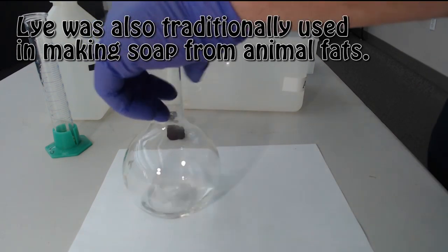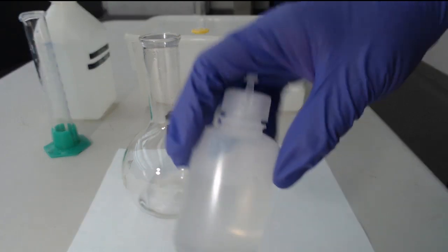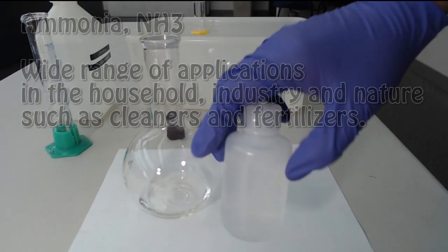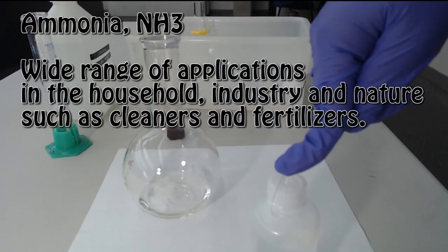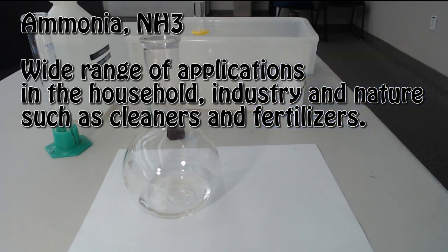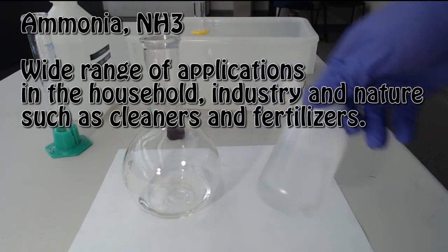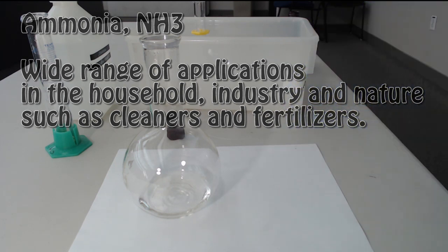Wait a second for that. And what else I have here? This is concentrated ammonia. This stuff is way more concentrated than you have in your Windex bottle. The stuff that you have in your house is probably about 1 to 5%. This is about 30%, so it's much stronger.